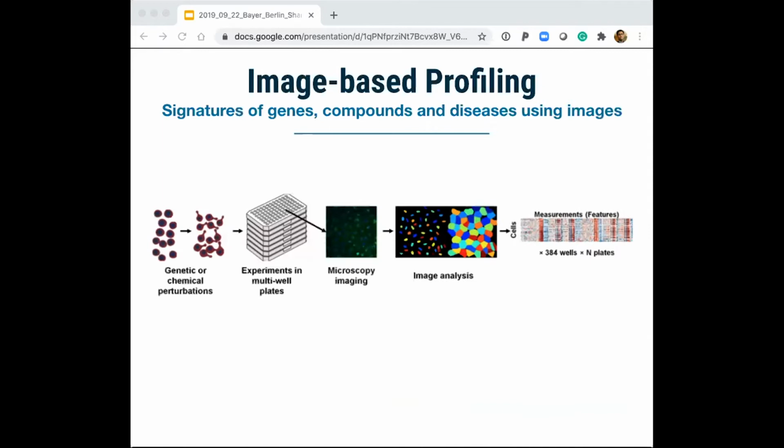And then we can also scale it up in terms of the number of perturbations we can measure with automated microscopes, and then scale it up again by extracting thousands of features and metrics from each cell. And the question then is, will there be changes in the quantitative metrics that we cannot discern by eye that nevertheless indicate similarities in the underlying cell state?